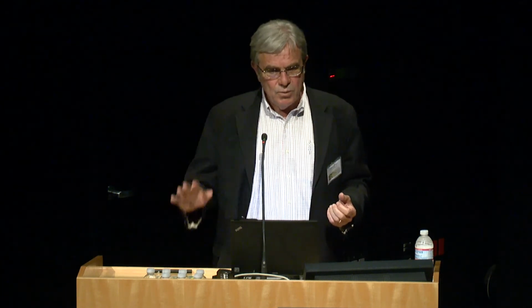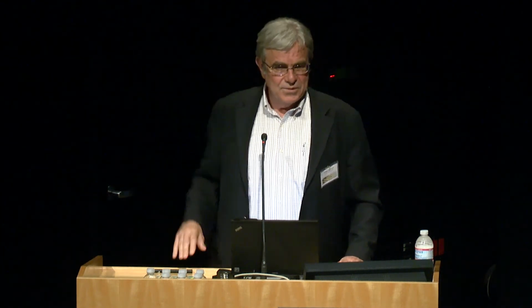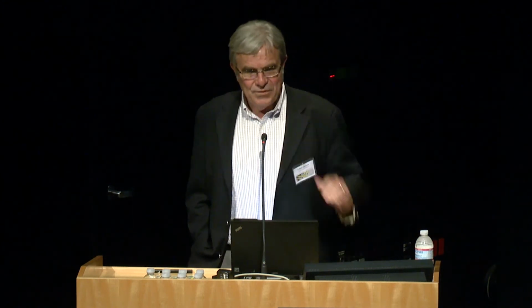What we did was what's termed extinction. We let the animal press the lever, but it wasn't connected any longer to the electrical stimulation. The animal gets really angry, and starts hammering on the lever. What's wrong? What's broken? And then he gives up. During that time when he's hammering on the lever, the norepinephrine goes up. So it clearly shows that dopamine and norepinephrine are doing two distinctly different things during this ICS experience. And admittedly, we need to do every neurotransmitter in the brain, and we don't have a probe for all of them to fully answer your question.